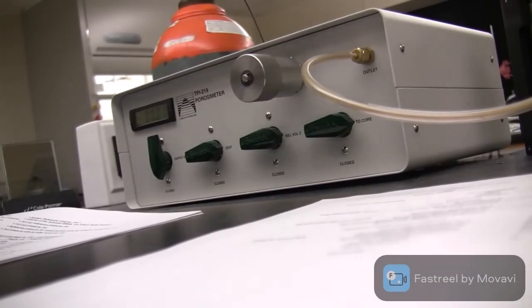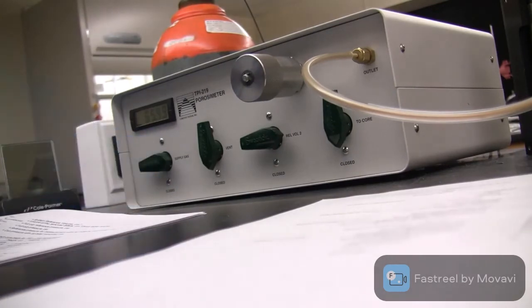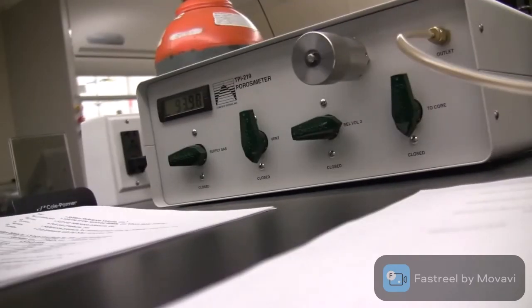And then we put it back in its locker here and make sure it's tight. So after that, we start repeating what we did again. So first close these two valves, open your supply gas, check go back to 95 or 94. And let's wait until it stabilizes.